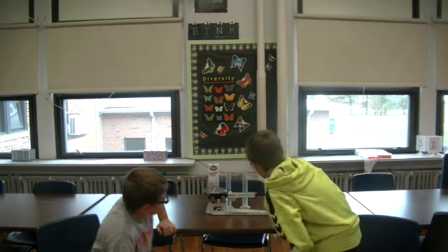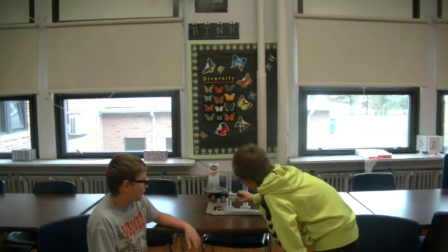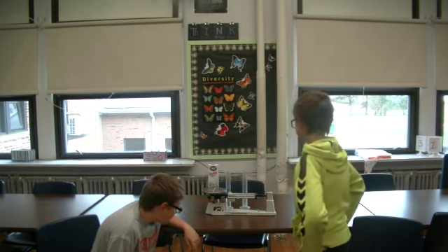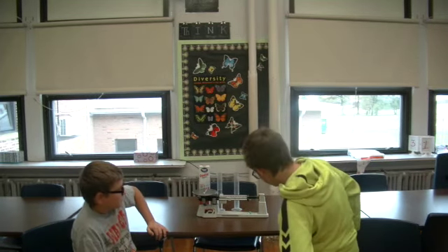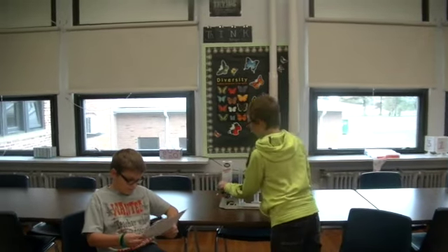That looks okay. Looks almost, maybe a little bit too light. Try 4. So yeah, let's do 4. Boom. See if that works. Not quite yet. Actually, just a little bit too heavy, so let's go to 3.8. It looks like it's 3.8. Yep, it's 3.8. Okay. So now you know how much this pencil weighs.